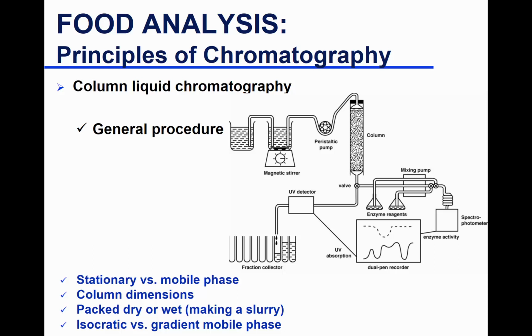So, that is an example of only reverse phase. You don't always add organic solvent to increase the strength. It depends on the mode of separation. That is a very common mistake that students would make. How do you increase the strength of the mobile phase? Increase organic solvent. No, we don't increase organic solvent when your mode of separation is normal phase, for example.